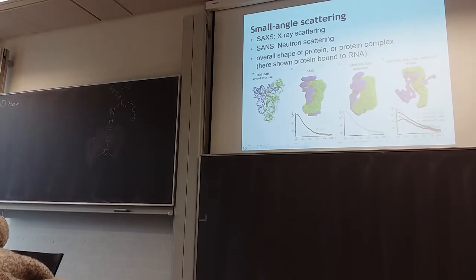Yeah? This method, don't you need to hit at the exact same spot to get a similar scatter pattern? Or can you imagine that that scatter pattern would be totally different if you hit it from another angle, for example? Yes. So, no. You can actually get the shape information just from enough random scattering events, but it's not a very precise measurement.